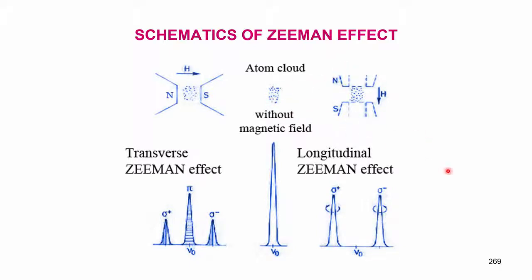I have to tell you at this stage that Zeeman effect background correction is one of the most important developments in atomic absorption spectrometry. And the signal measured is always less than the normal atomic absorption signal, because the absorption line is split into 2 or 3 components and we measure only one component, that is pi component or sigma component. And the arrangement of atoms, I am making it clear to you in this slide.